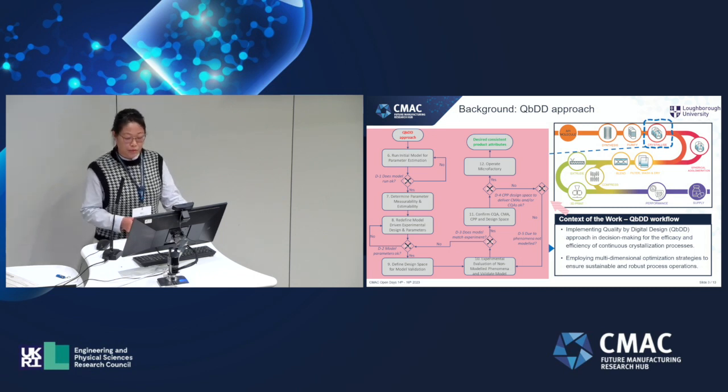The QbDD workflow has already been introduced in detail in Cameron's talk, and here is the outline. It begins with the initial model parameter estimation and goes through to the final microfactory run, aiming to ensure consistent desired product attributes.